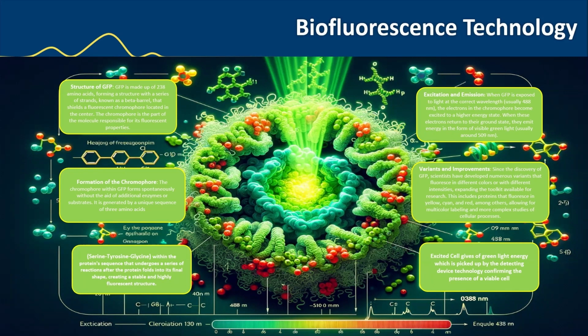So, the detection of viable particles from an air sample stream or from an exposed media dish using ultraviolet light wavelengths, typically of about 480 nanometers. The cells will pass through these wavelengths, and that wavelength will excite the cells, and they'll actually give off a biofluorescence of their own, a visible green light spectrum about 510 nanometers. And this is what the biofluorescent particle counter will pick up. So that technology is around. I have been around this technology for about 12 years.